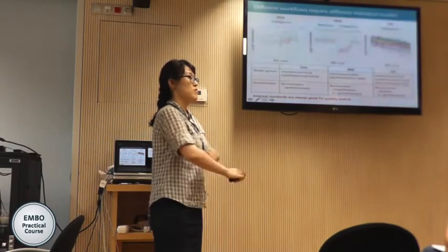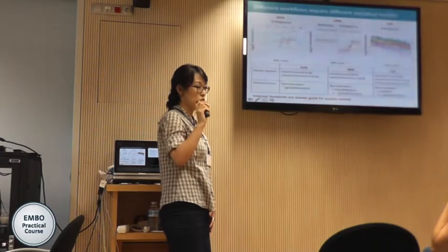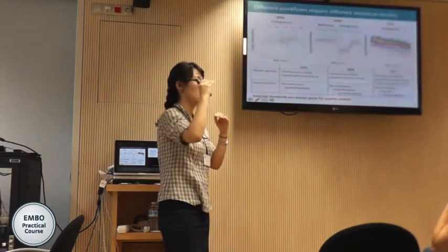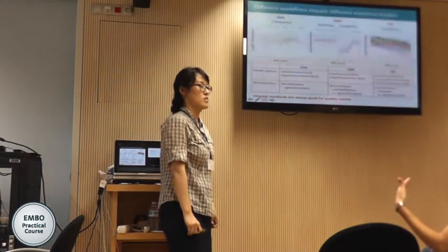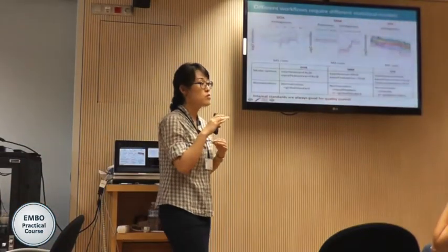No. If you use false for unequal variance and they have an equal variance, they just weigh the equal amount, so it doesn't matter. To be on the safe side, if you are not sure, it's better to put false. Or you can use true, and then check the residual plot or QC plot.